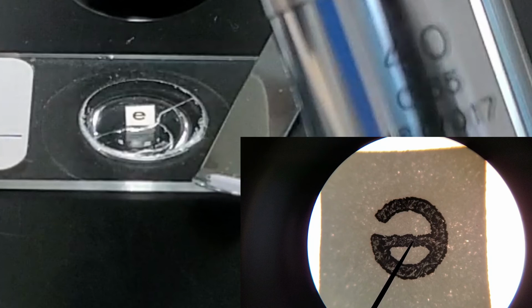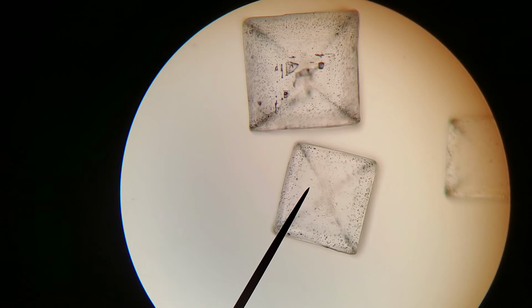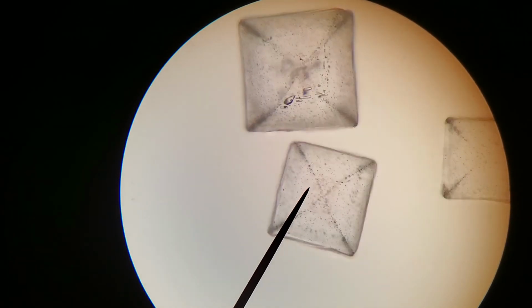Here I'm going to look at a different sample. We're going to look at some grains of salt under the microscope. So we first put the sample on the stage using the low power objective lens. We're going to bring our sample into focus using the coarse focus adjustment knob, or the larger of the two knobs. Then we're going to change our magnification to the medium power, and we're going to refocus from here on out just using the fine focus.